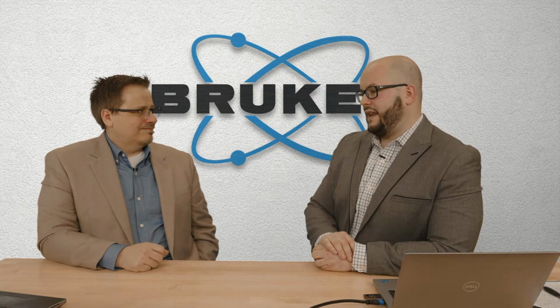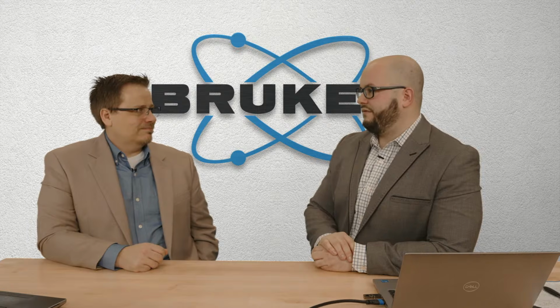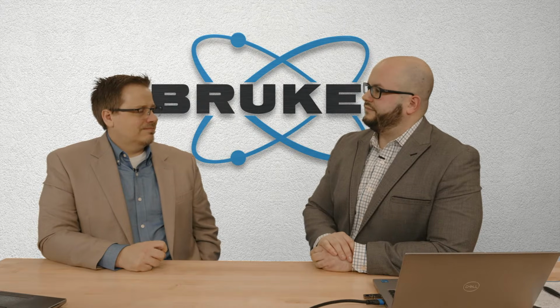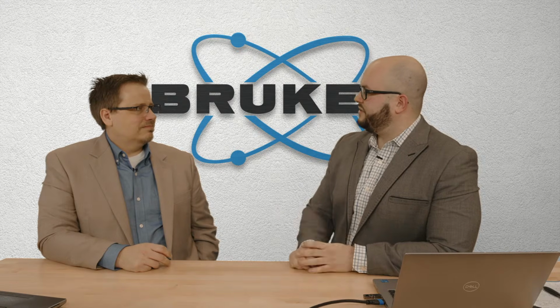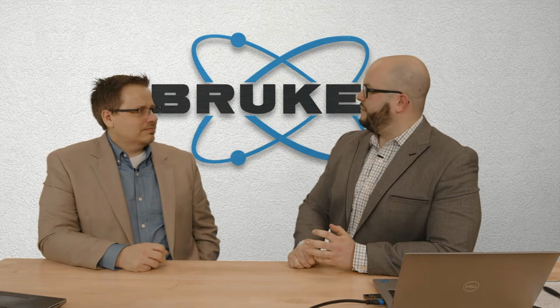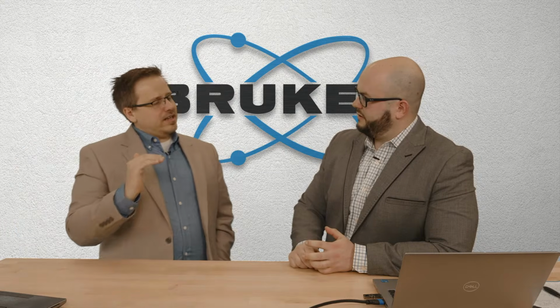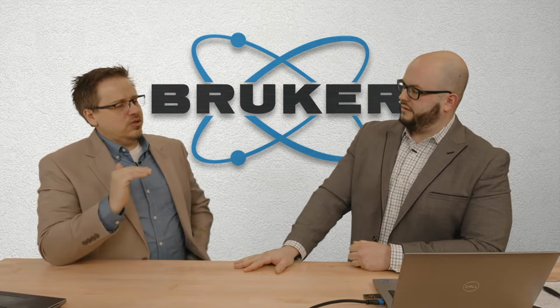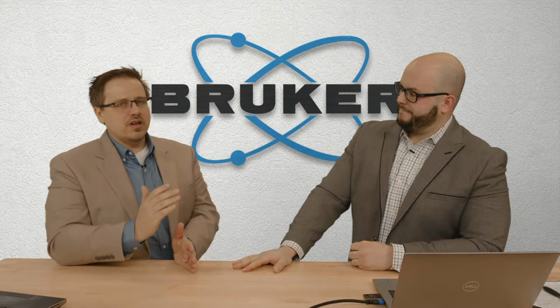I think that with thermal expansion, you're generally going to have a consistent expansion, right? If you think about that, your expansion is going to be similar in all directions, I think. So wouldn't that be more of a hydrostatic stress? So that's going to change the lattice parameter, uniformly. Generally in XRD, what we're assuming is that the only change of the lattice parameter vertically is due to the Poisson effect.